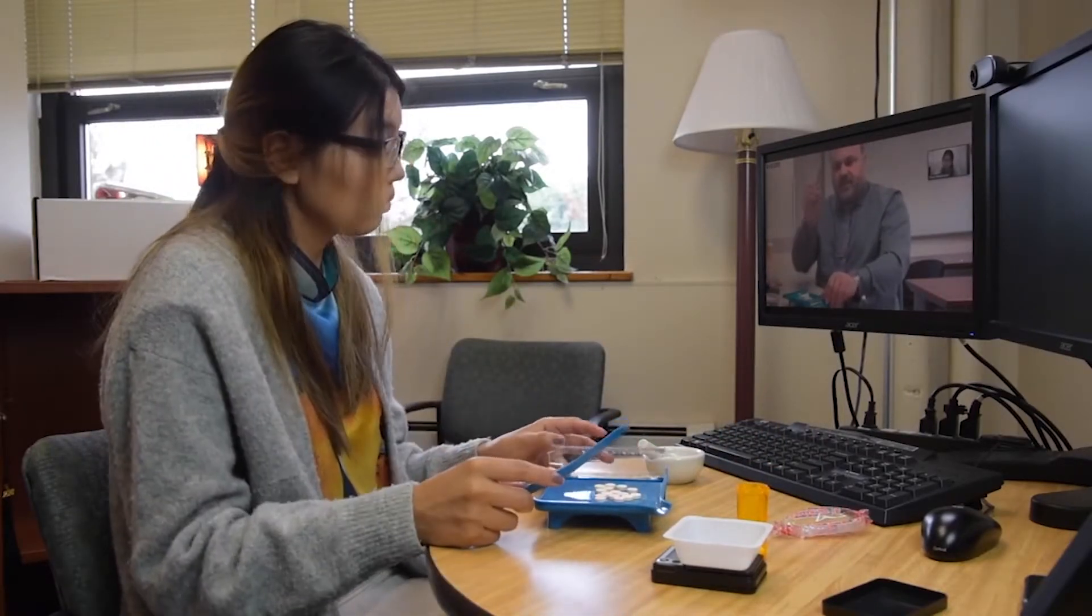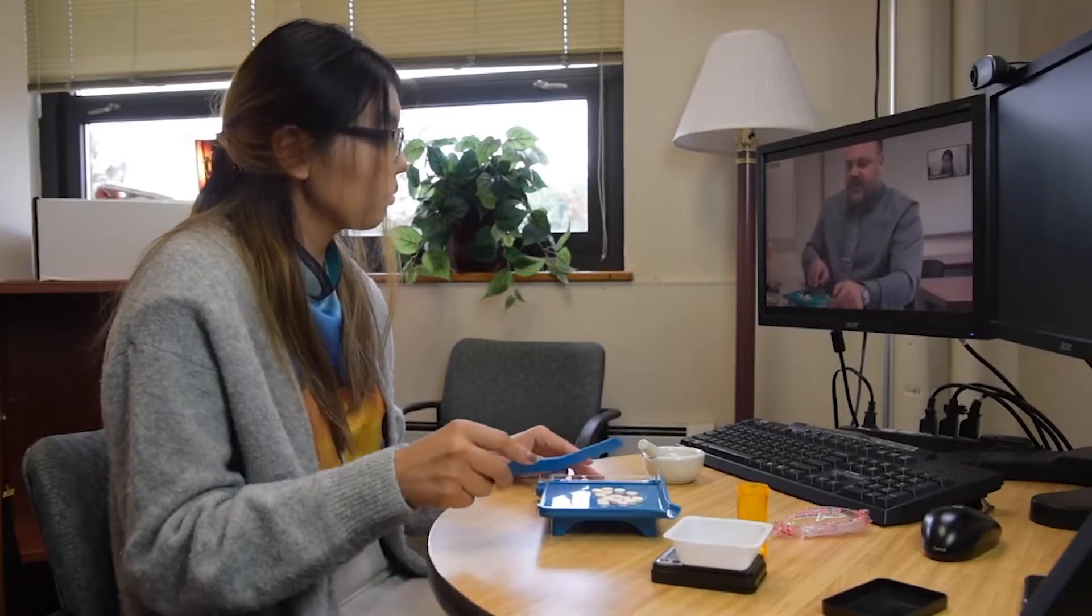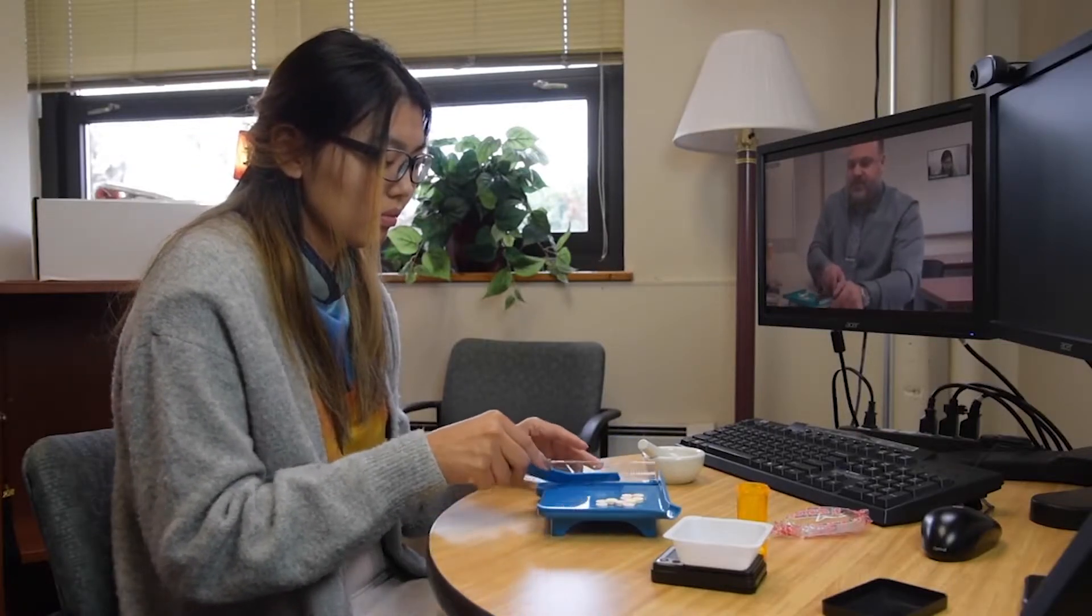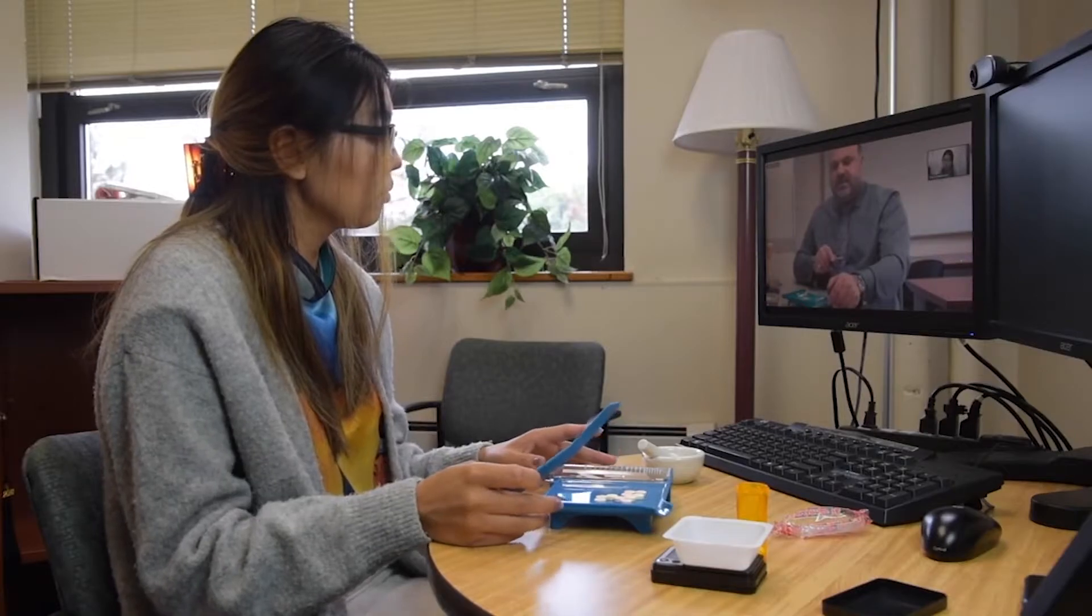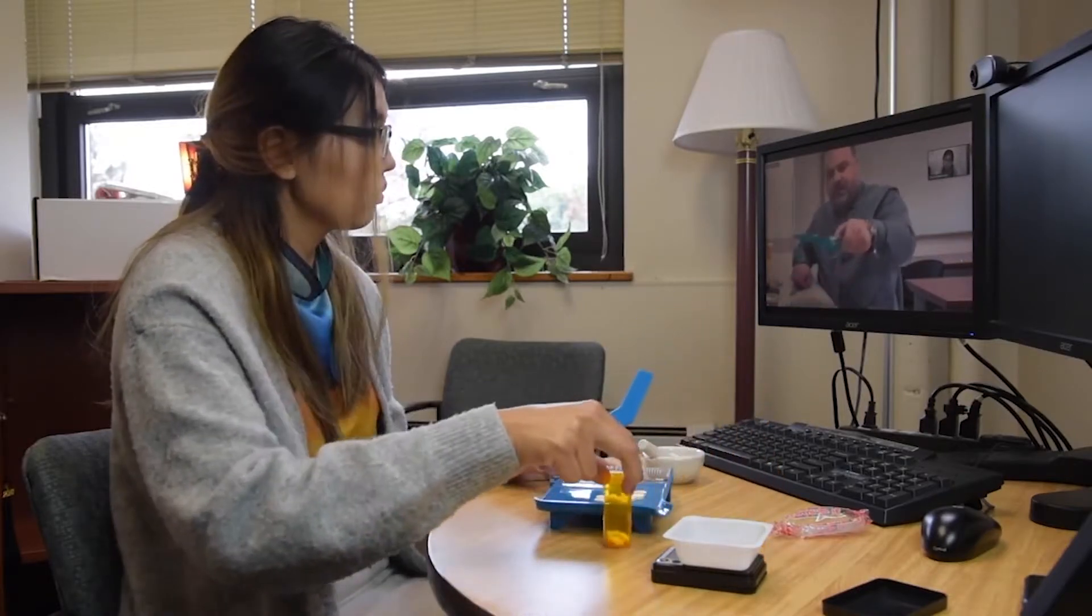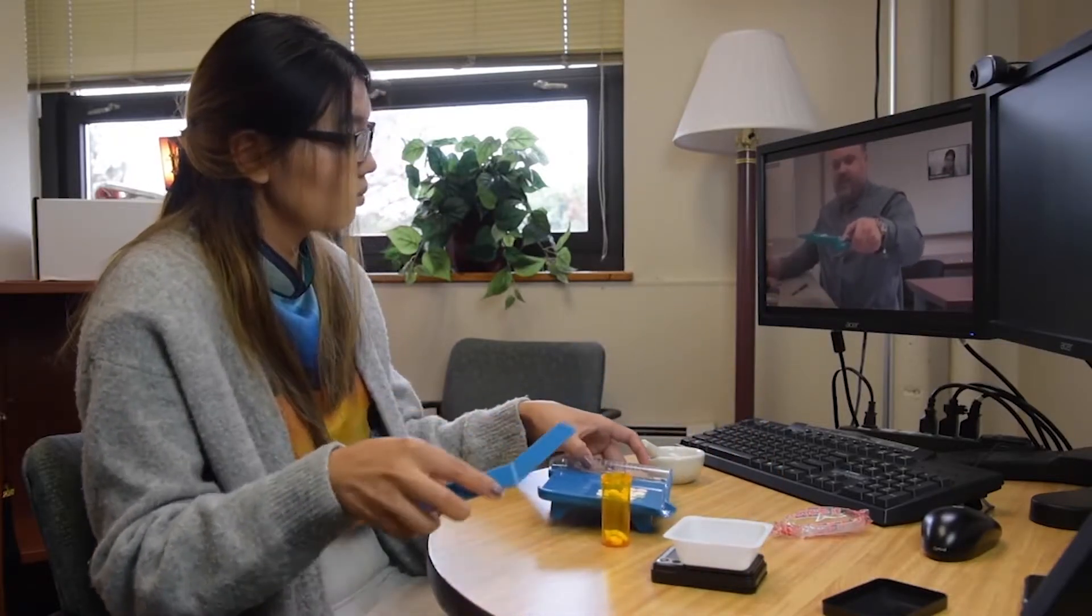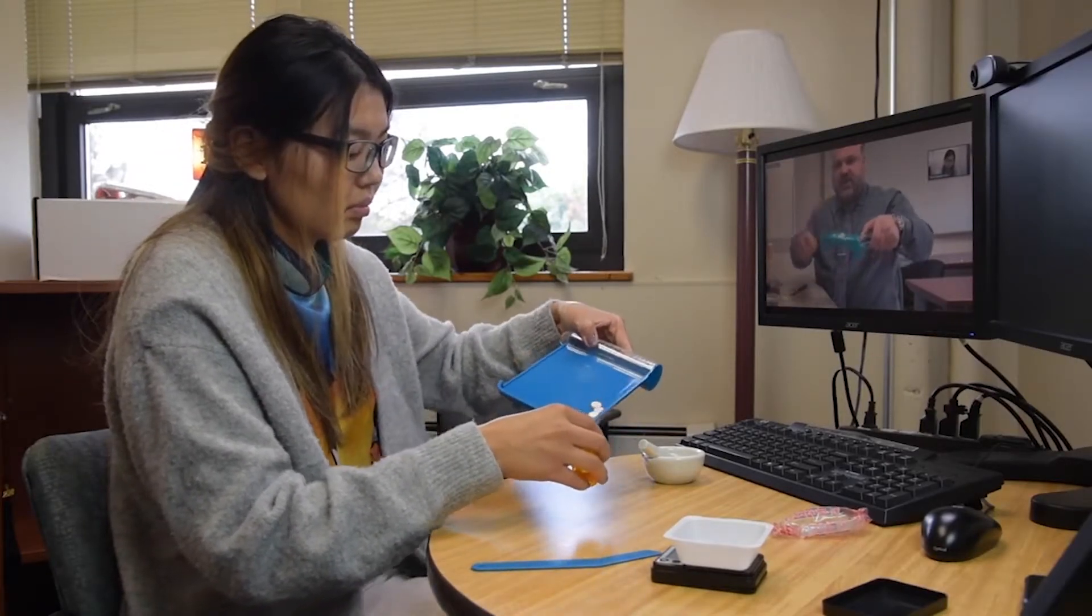Using your spatula, you're going to count out five Smarties. Slide them into the black container. Close the container, pick up the counting tray and pour the excess into your prescription vial.